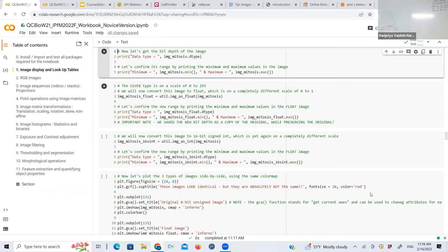Sometimes taking the most beautiful image possible makes all the difference. I've actually done that behind the scope instead of just letting the scope deal with it. I ran into this challenge with a collaborator who thought they would take some pictures and give them to me, and that the computational person would just make magic with it. That's why I really wanted to emphasize the image correction part.